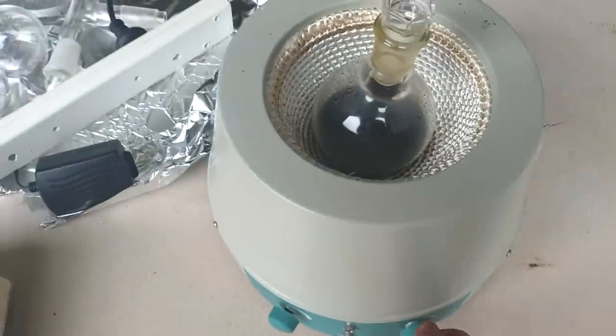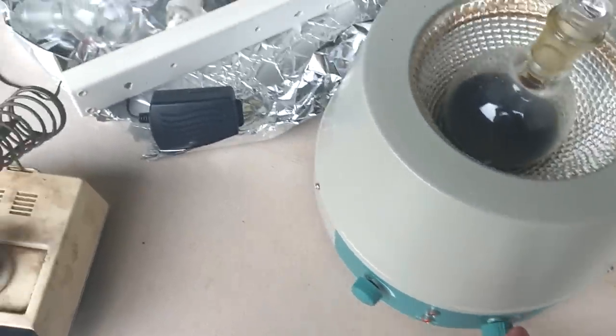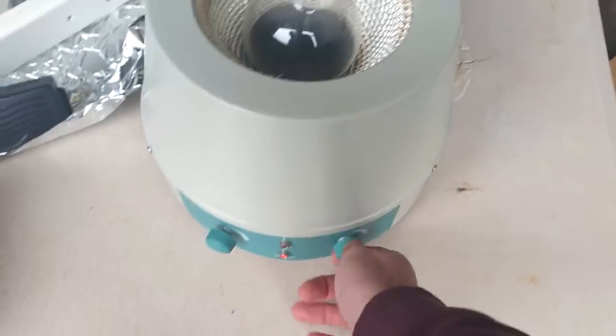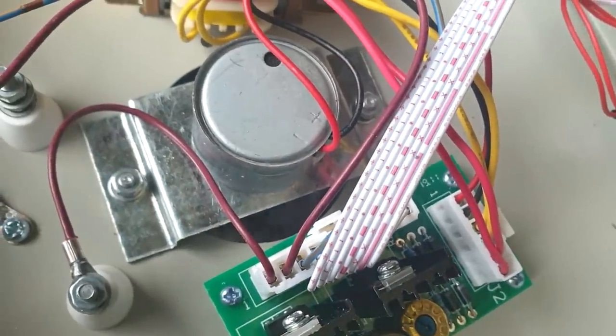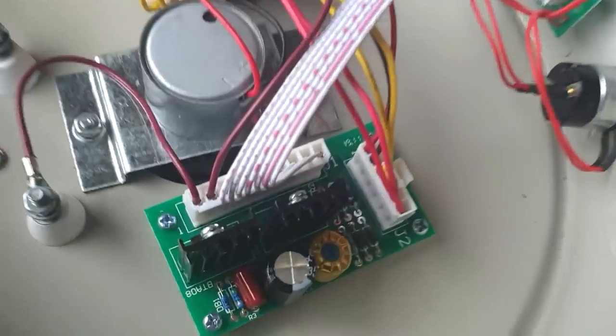The next thing to repair is this. Why is my stirring not working? I got a stir bar in there, and it's not stirring, and I tried a different stir bar, and it's still not stirring. So, all right, I'll take this apart as well. Yeah, sure, all right. Still spinning. So why is it not spinning the stir bar?